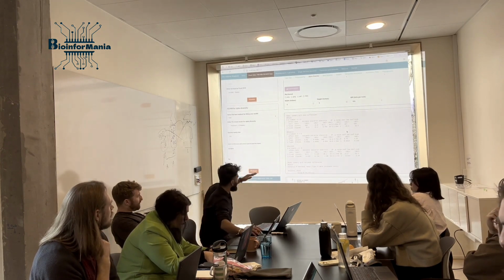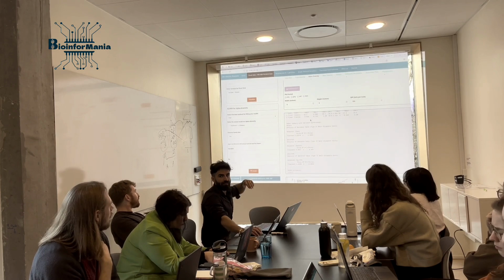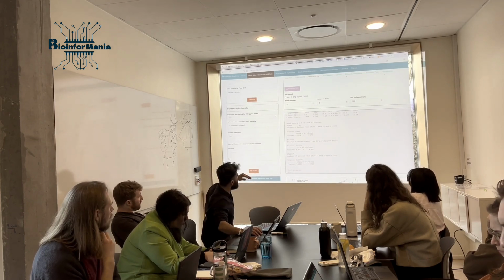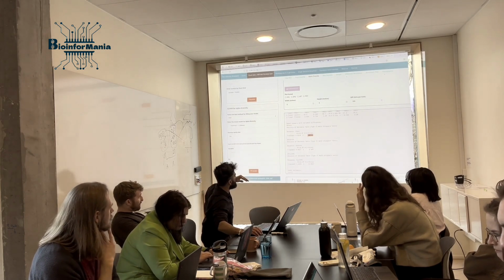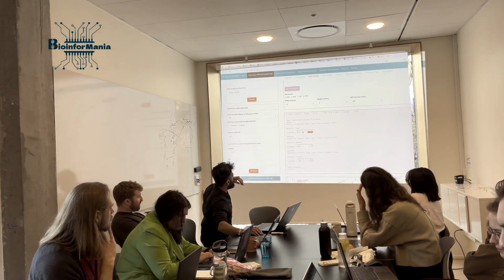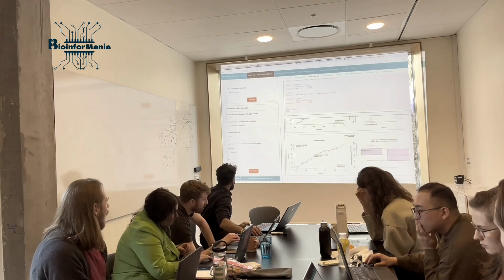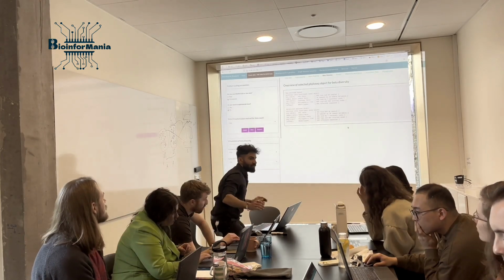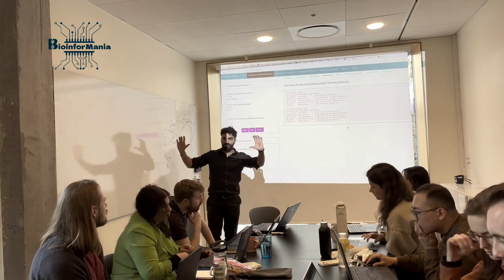Now we look into the variance. So this was the analysis of mean, and now we want to see the differences of variance. This is based on a chi-square distribution with a certain level of degrees of freedom and a chi-square test. Now we could go to beta diversity. We have looked into diversity within samples. Now we are going to see the groups.